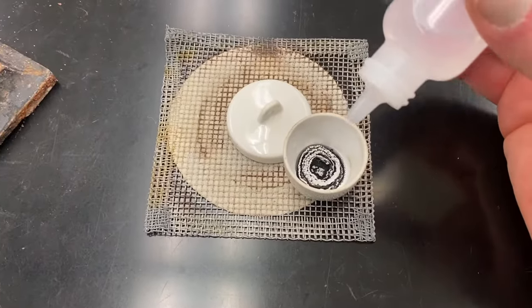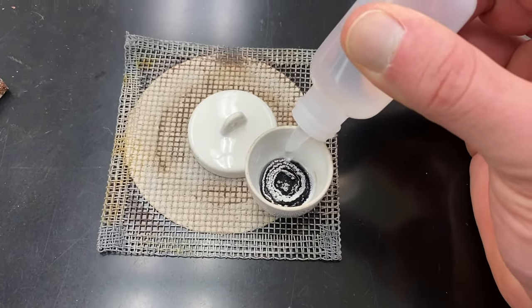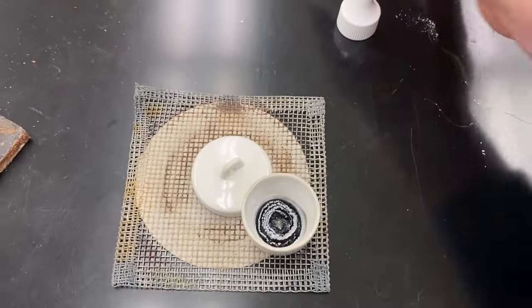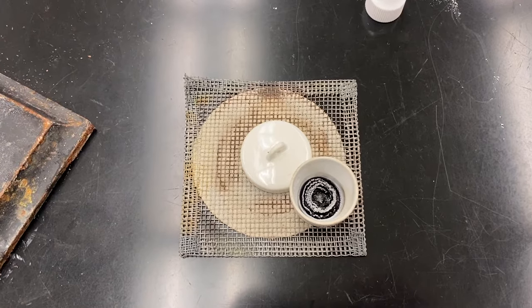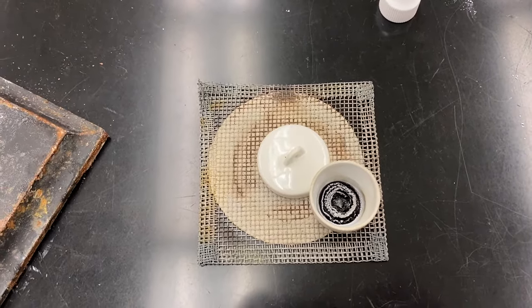I'm going to add 10 drops, trying to get it all over the sample. I added a few extra just to make sure I got the entire sample. That is reacting the magnesium nitride so that we're creating magnesium hydroxide and ammonia gas.